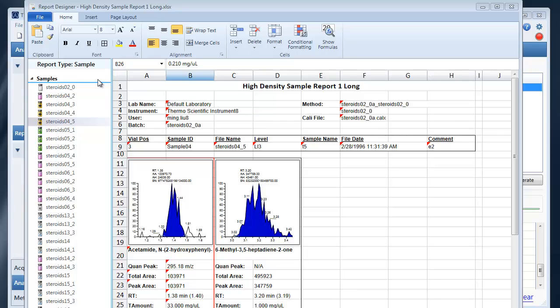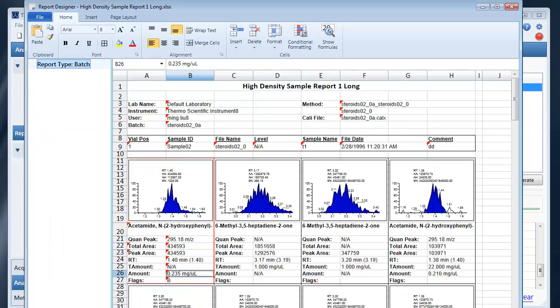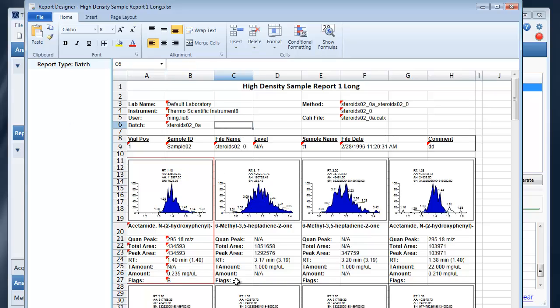You'll notice that when I switch from sample to batch the samples on the left nav will disappear because the report now displays all samples and compounds.